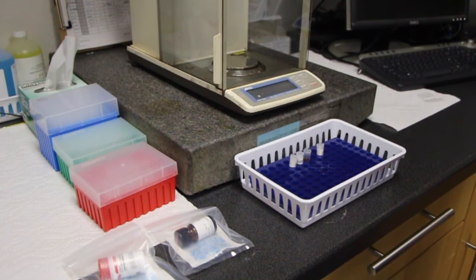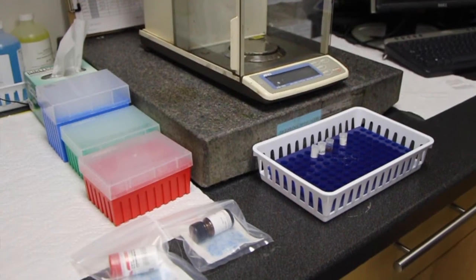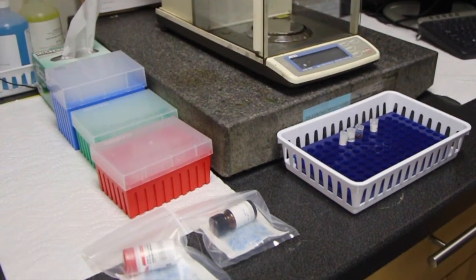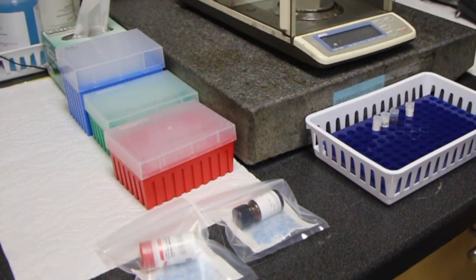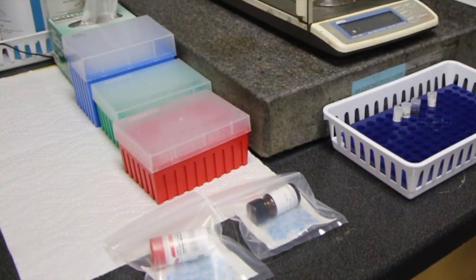First, remove the EDC and sulfo-NHS from cold storage. Allow the bottles to sit at room temperature for 15 to 20 minutes before opening. This is important because moisture from the atmosphere can condense on the cold powders, causing them to hydrolyze and degrade.